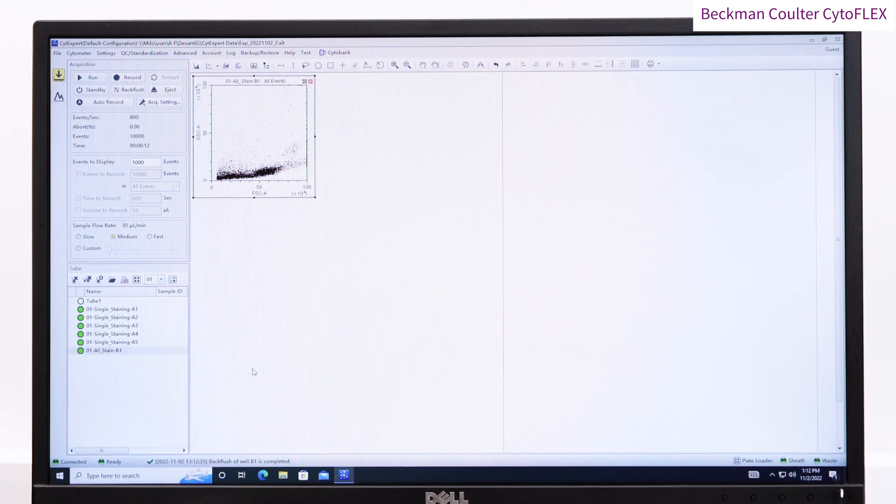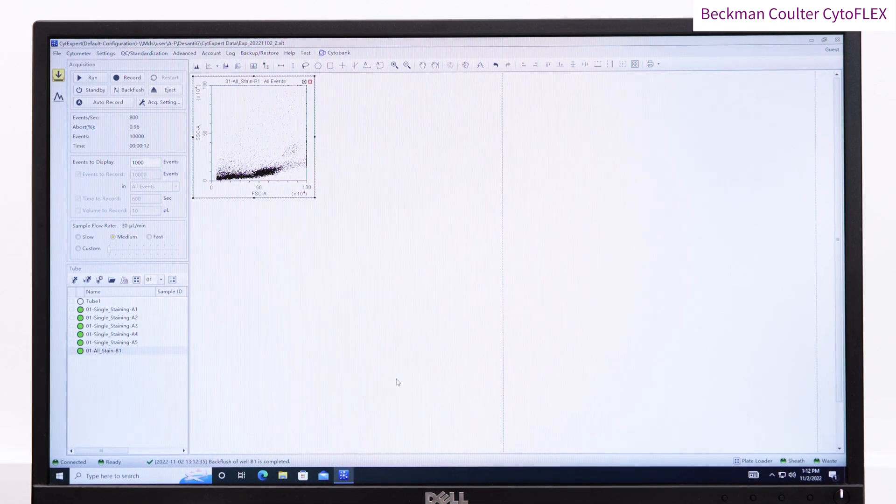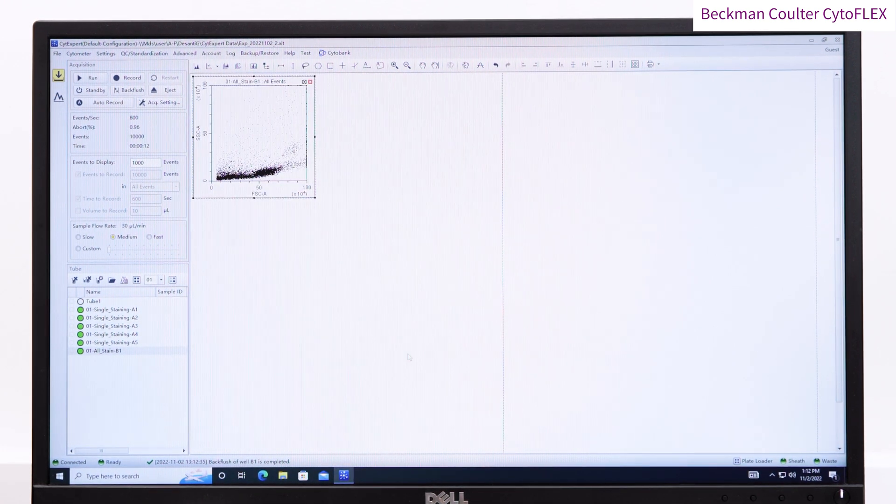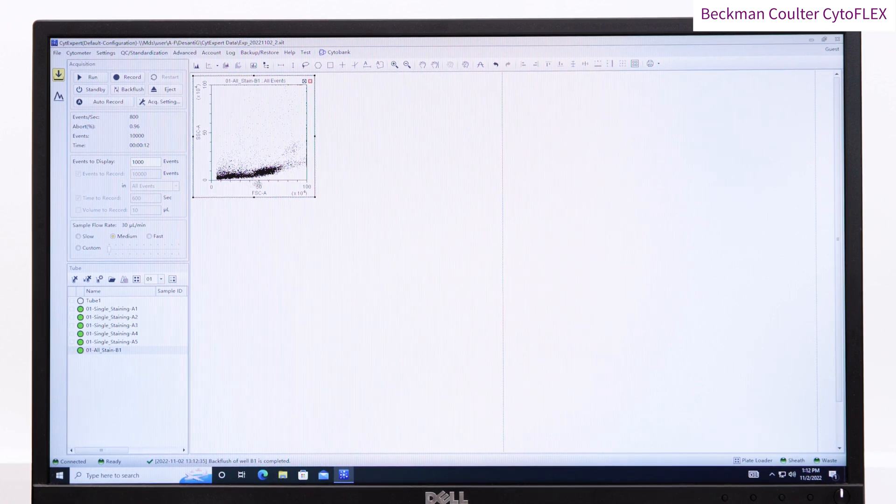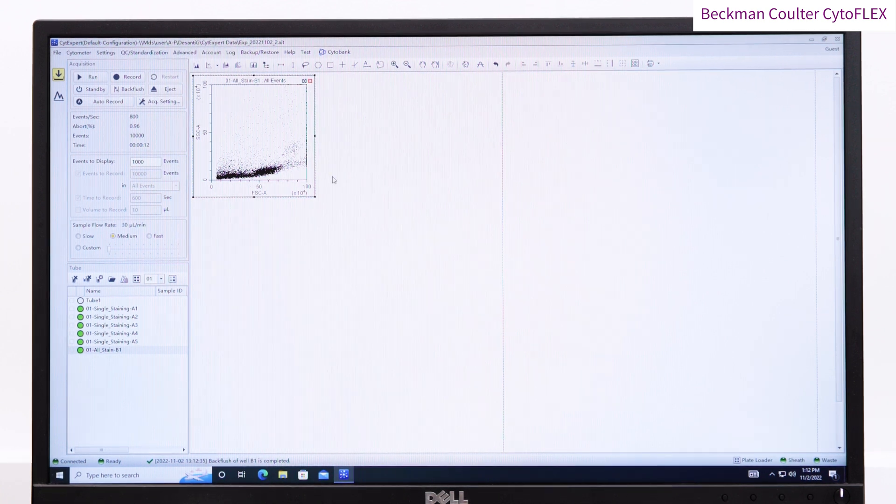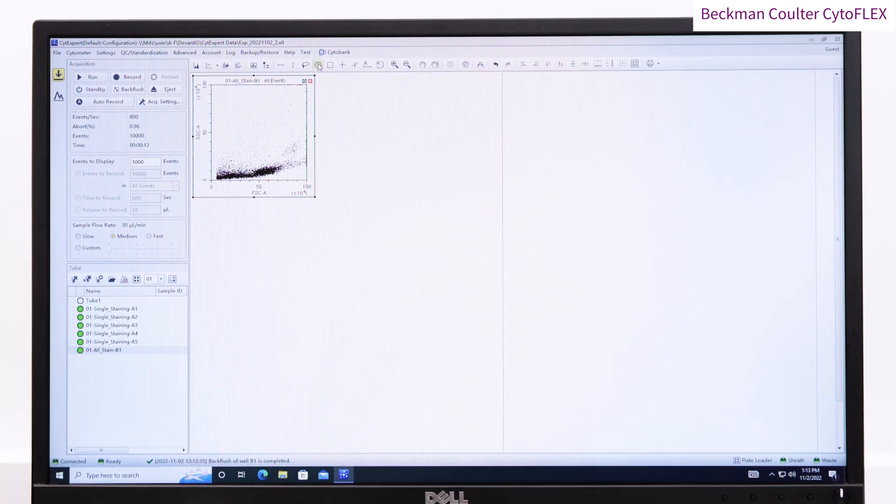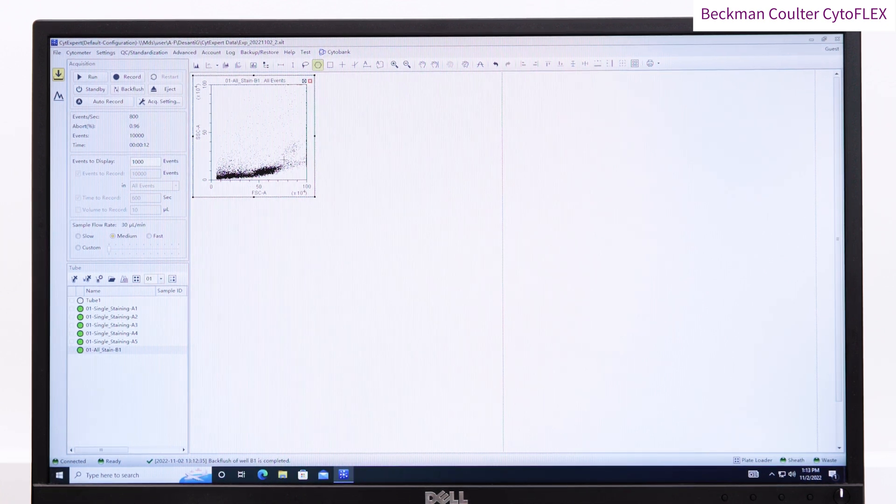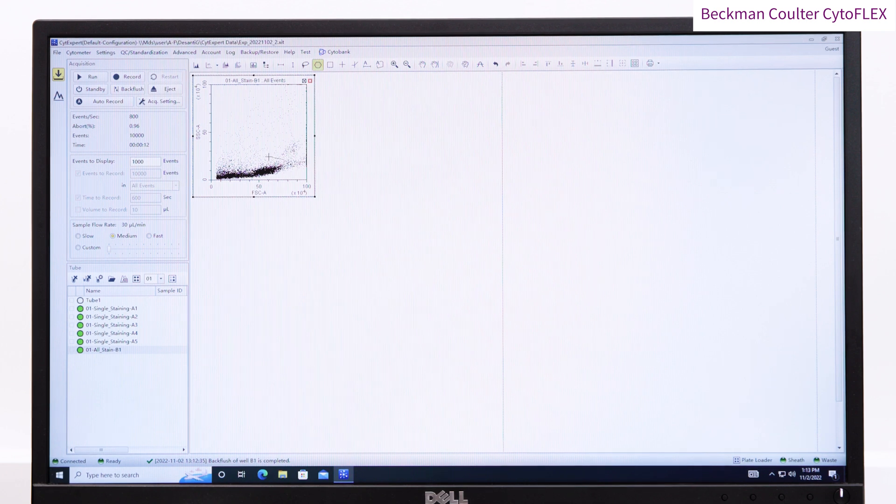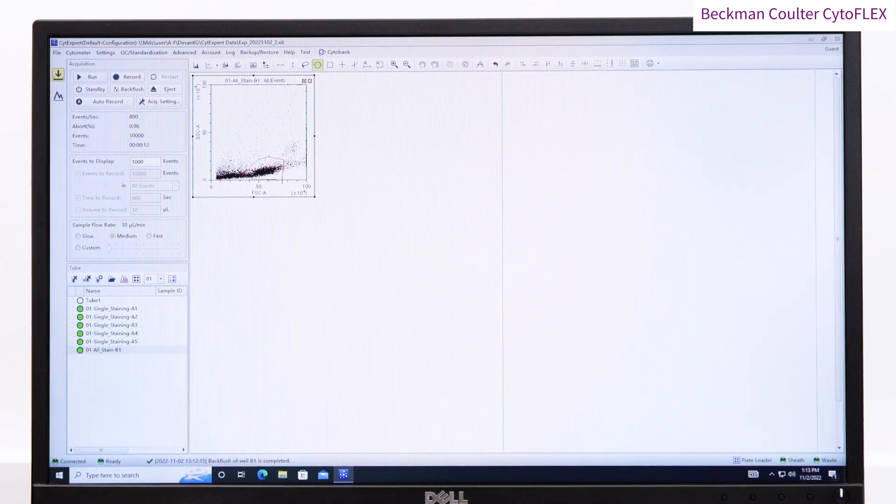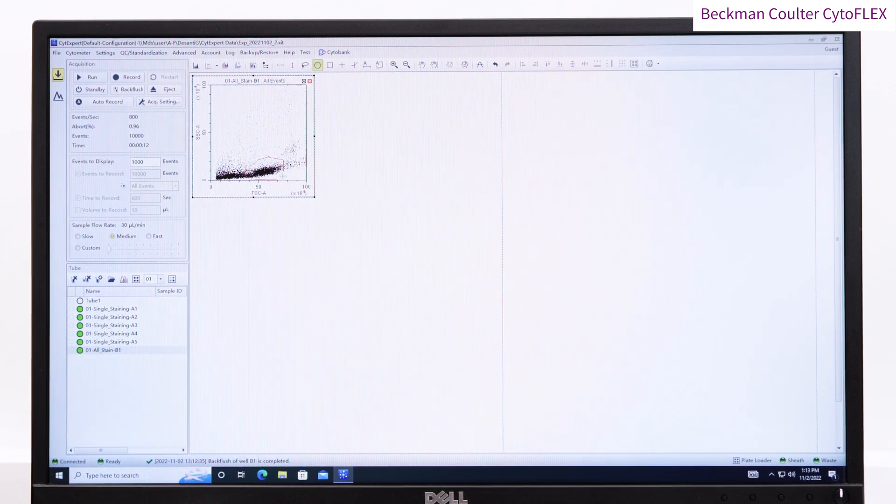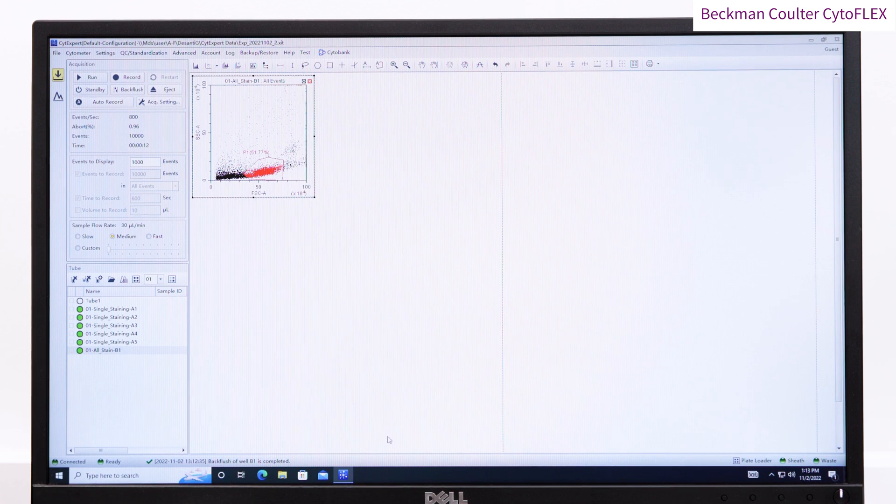Here you can see along the top ribbon are options for different plot types. You can create various different versions of dot and density plots as well as histograms. Start by creating a forward versus side scatter plot, and here I'm going to gate the cells of interest using a polygon gate.